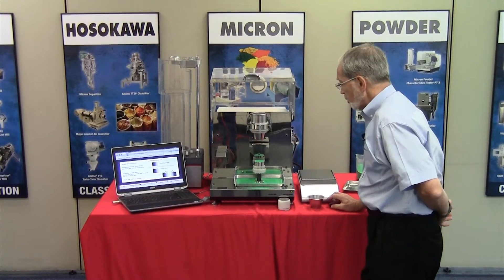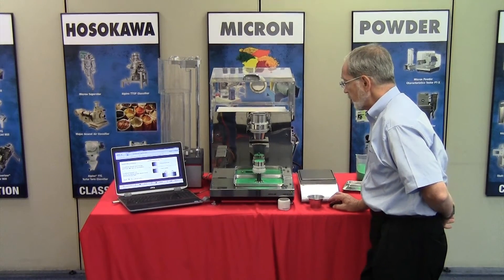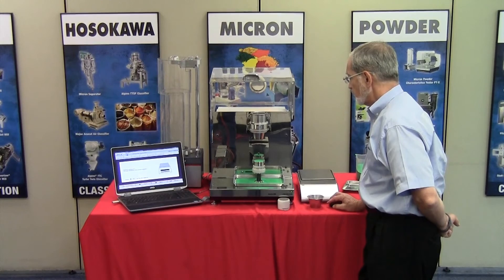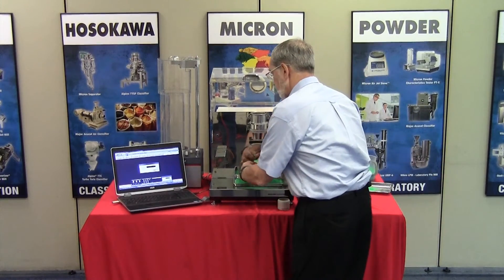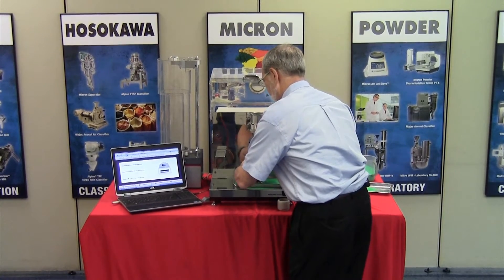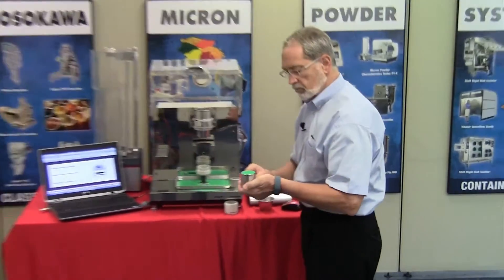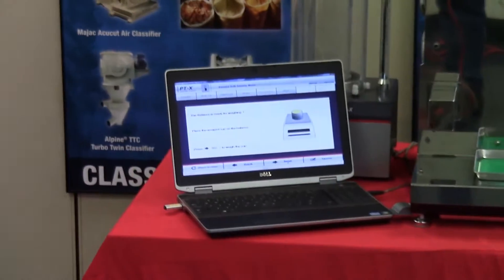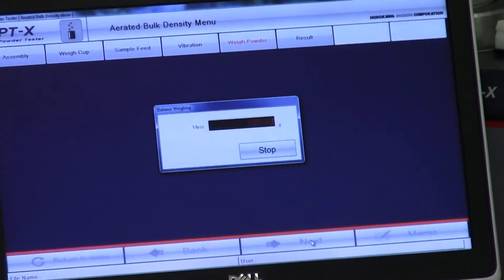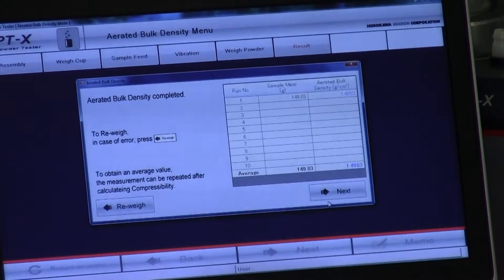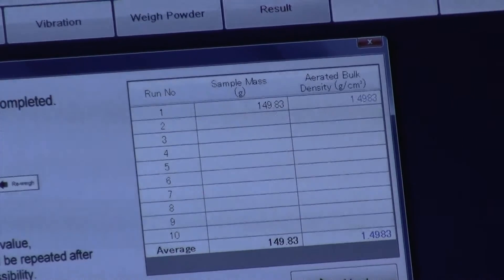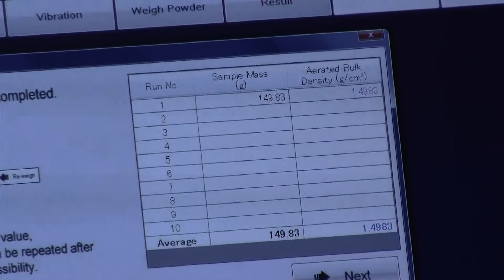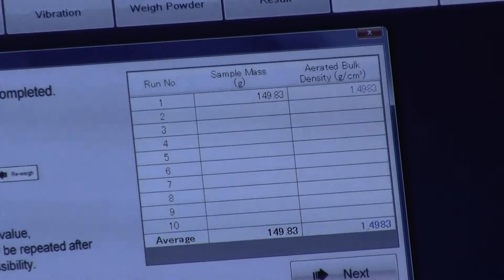Once we've scraped the 100 cc cup, the balance needs to be tared. We press next, remove the cup, place it on the balance to take the weight. We now have the results of the aerated density test. The aerated density is 1.4983 grams per cc.